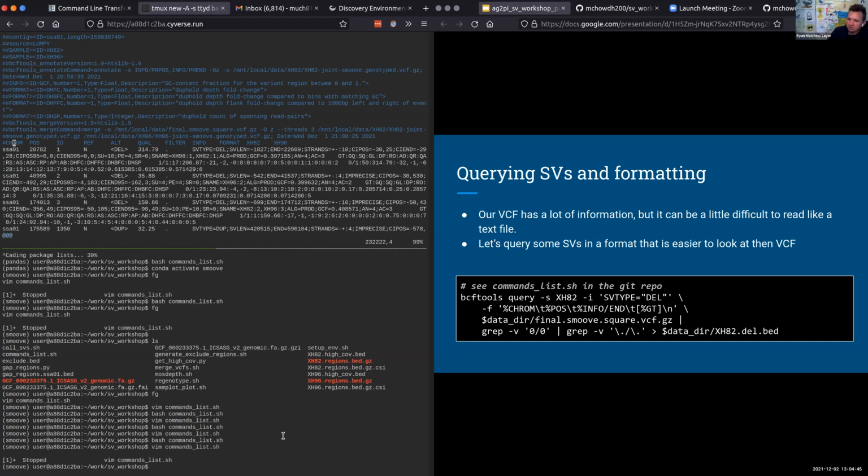All right, so there was a question about what all needs to be installed if you're not doing it in Cybers. And so we specifically chose this environment called Conda, which is a little bit complicated and doesn't always work, but it's the best way. You can kind of think of it as a virtual environment. So it's not a full virtual machine like you might have heard of as running on the cloud.